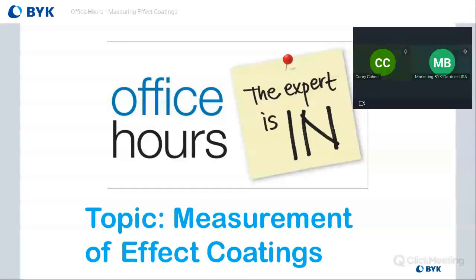Glass can be a bit tricky. If you're talking about transparent glass, maybe colored transparent glass, typically reflectance spectrophotometers don't work great on those. What you could do is try measuring with a white backing, get some sort of backing that you can take your measurements over. But we'd have to know more about exactly what type of glass you're dealing with and what the transparency level is to tell whether it would work.